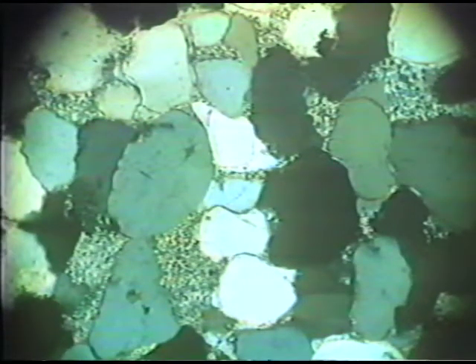That is the maximum interference color. For example, this particular grain, even though I rotate the stage throughout a large degree of rotation, its maximum interference color is only a very, very weak gray color. This indicates that this particular mineral grain has its c-axis nearly perpendicular to the stage. It only develops a very, very low birefringence.